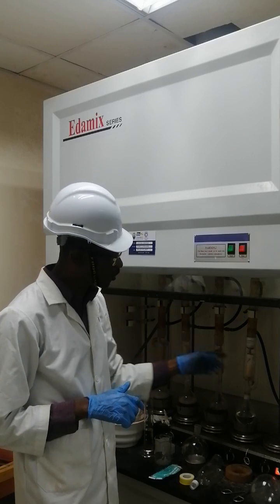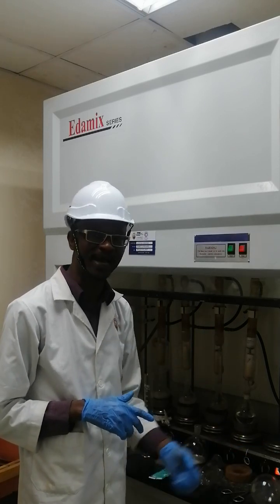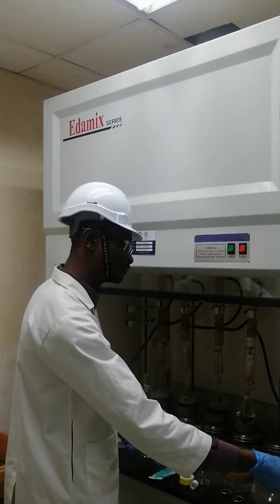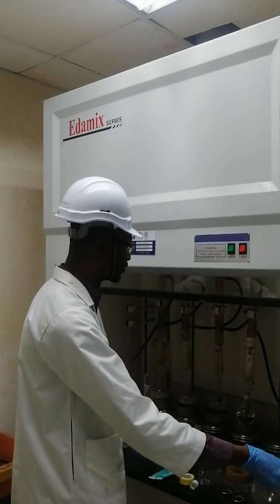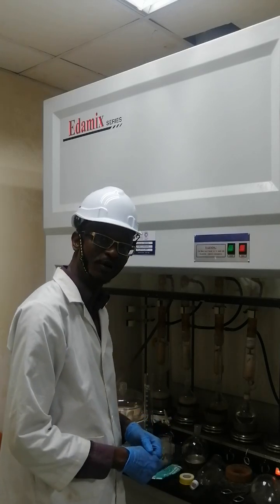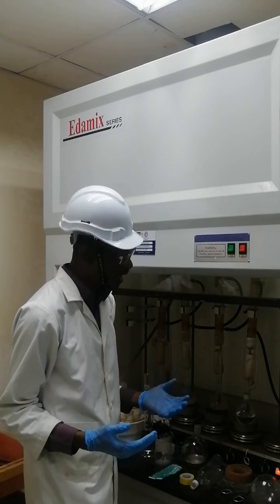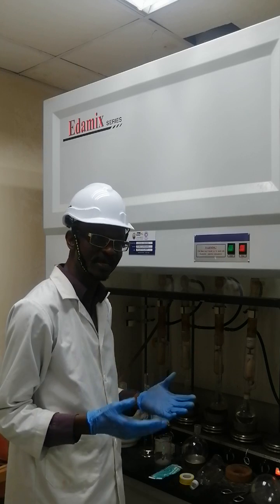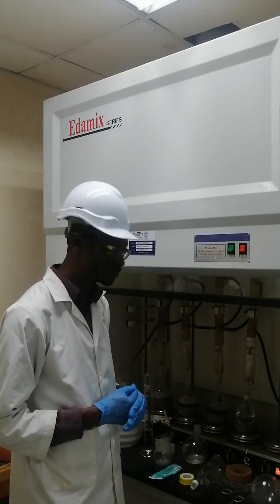So hence you have to connect the condenser to the tap directly, and you open the valve of the inlet water supply. Make sure there is water flow before you switch on your hot plate. But in some laboratories you may not have direct water supply. Maybe there is a shortage of water, or there is no pressure in the tap.